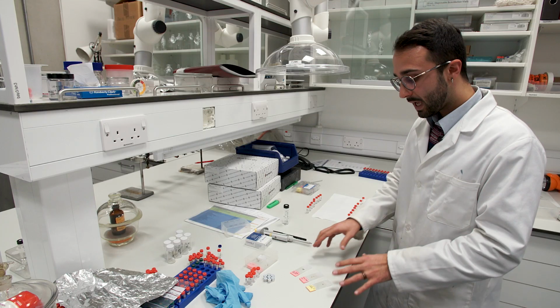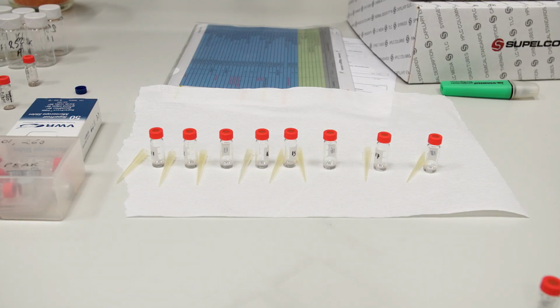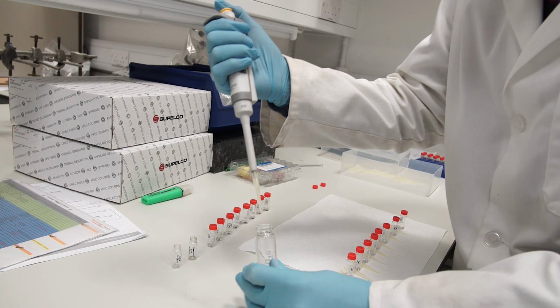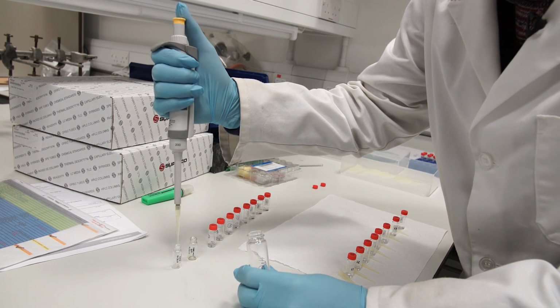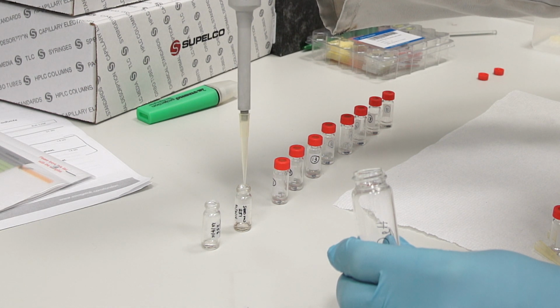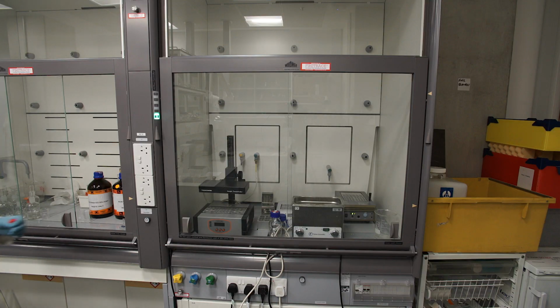The next step is when we separate some of these fibers, we put them in these vials and we perform the extraction of the dyes from the fibers. What I'm about to do is to add 200 microliters of this mixture of solvents, and we are adding a little bit of oxalic acid, which is the agent that allows us to break the bond between the dye molecules and the fibers.